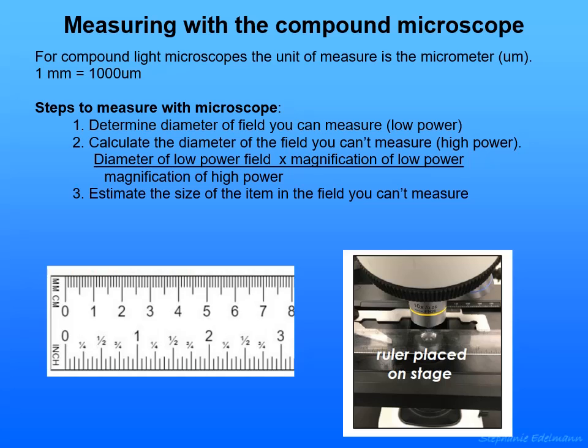But in order to make a mu, you need to enter a symbol that sometimes doesn't get interpreted correctly, and it doesn't get interpreted correctly in this particular program that I'm using. And so when people try to fake a mu for micrometer, they oftentimes put a U instead. So if you see that, it means micrometer in most cases. 1 millimeter is 1,000 micrometers.